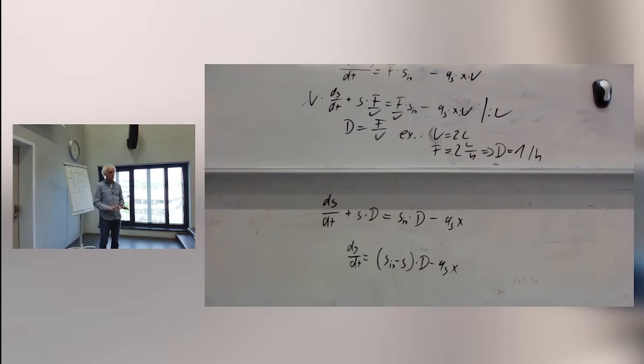But at present, we didn't do anything. And this is important. If you just look at your experimental data, you can, just by putting in your substrate concentration at time point 1 and time point 2, simply calculate the instantaneous, for example, the specific substrate consumption rate at that given time point. Yeah? Just by putting in the experimental values.